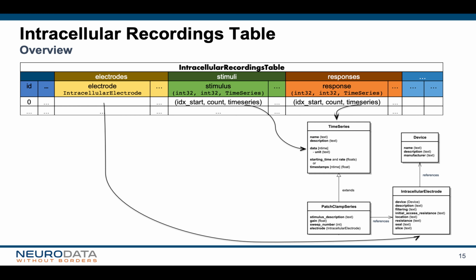This is to allow for greater flexibility in the future, as well as to allow for subselection of time ranges if different recordings should not align directly in the file.